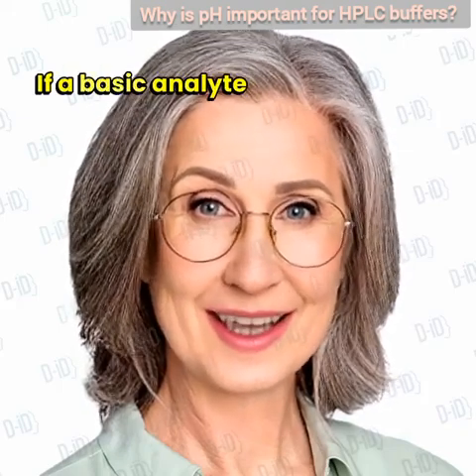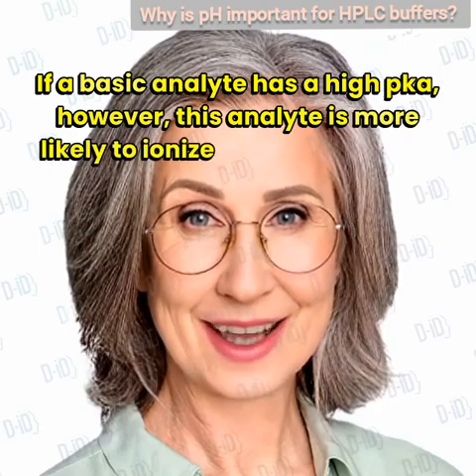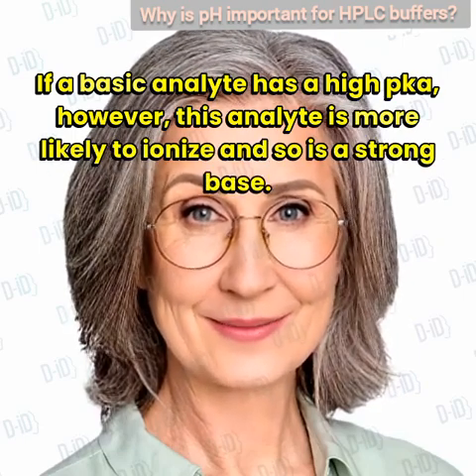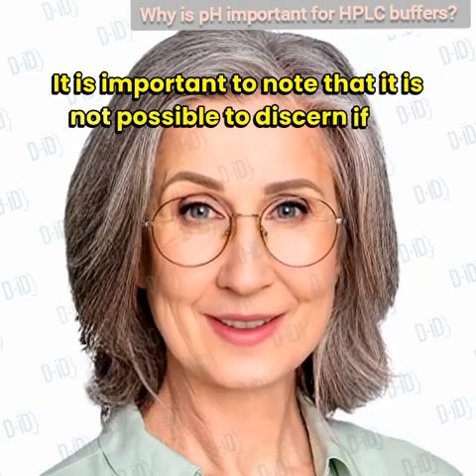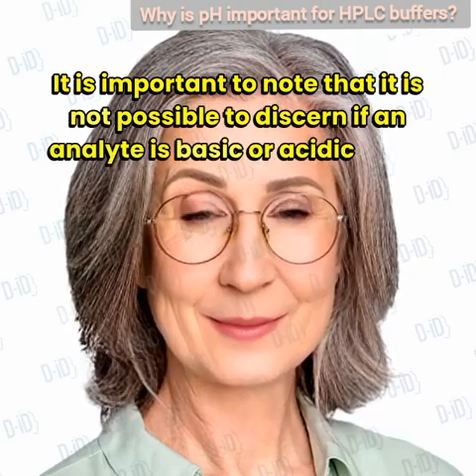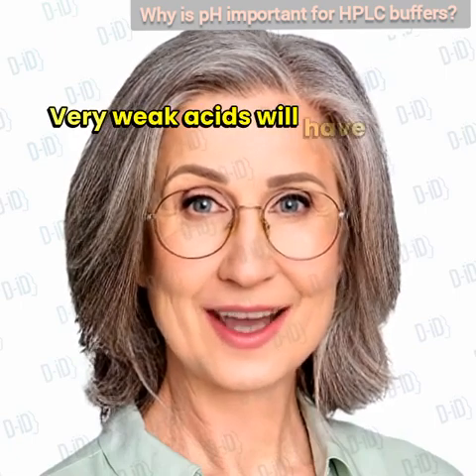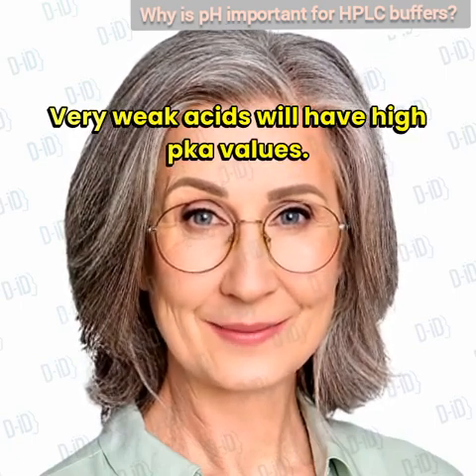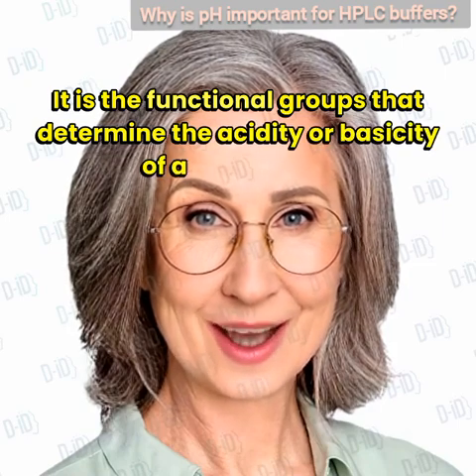If a basic analyte has a high pKa, however, this analyte is more likely to ionize and so is a strong base. It is important to note that it is not possible to discern if an analyte is basic or acidic by its pKa. Very weak acids will have high pKa values. It is the functional groups that determine the acidity/basicity of a compound.